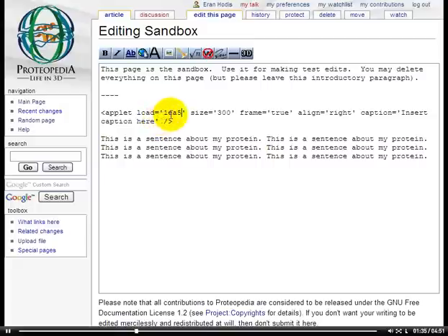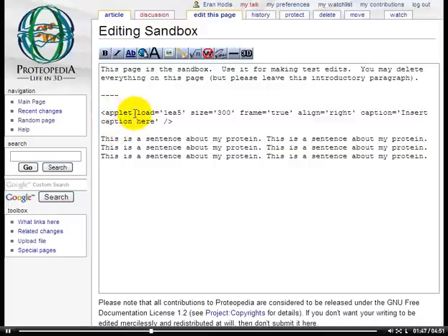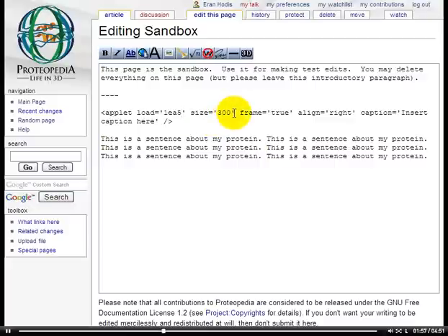You see that the PDB code or file name is surrounded by single quotes here. Let me take you briefly through the syntax of this applet. Here is the opening tag of the applet, followed by specification of the load parameter — what we want to load. In this case, the PDB file 1EA5. The size of the applet in pixels. A frame tells us whether we want a frame to surround our applet, a border.